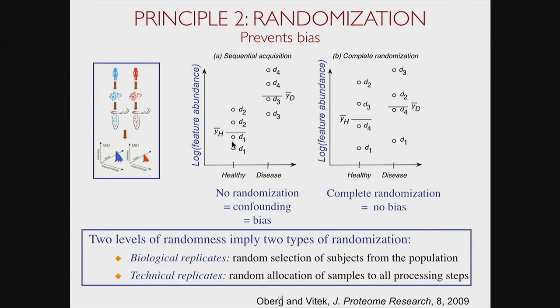So this is an example of a lost experiment where you cannot make any statements regarding the disease because the changes may be just as well due to the problem with the experimental protocol. And this is the case where no amount of statistical analysis will save that. So this is a really important part. And in my experience, the changes due to the time of acquisition are usually way larger than any biological signal. So if you have that, it's pretty much the lost cause.